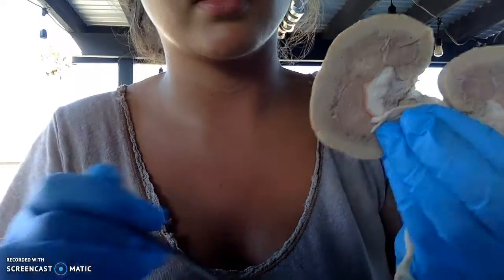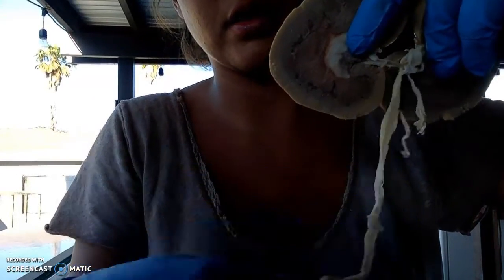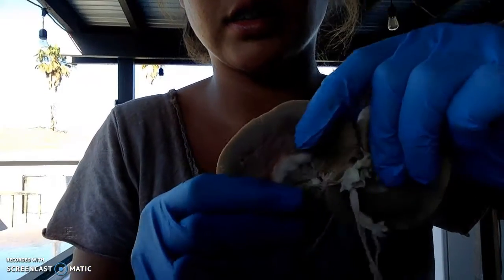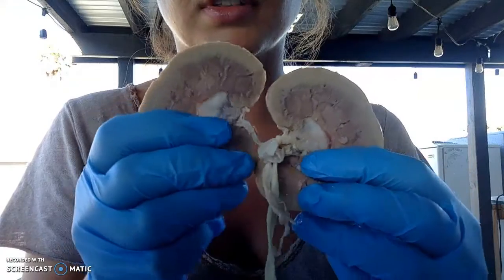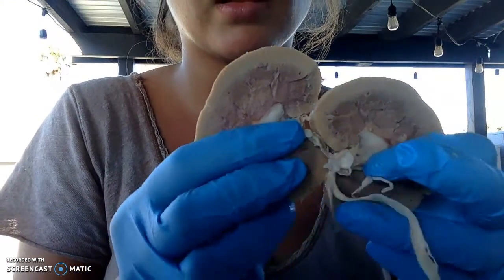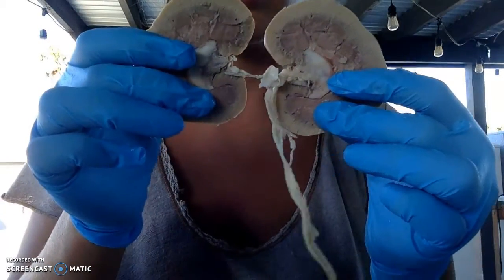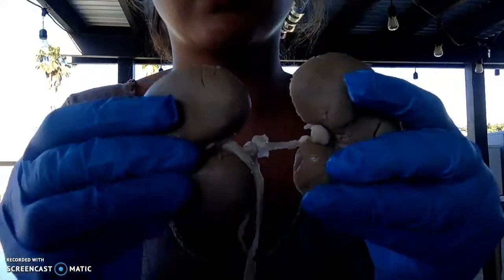And then the ureter, I'll show you on this side. So this is the ureter, and it's in between both sides of the kidney. It's this part right here. So it's just holding them together, and you can see it on this side as well.